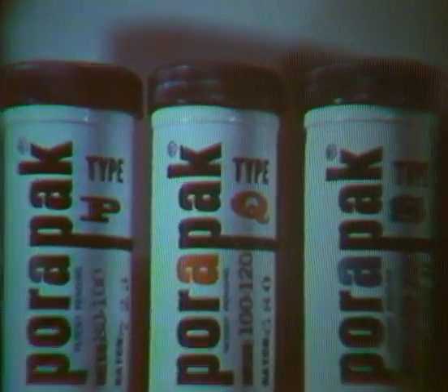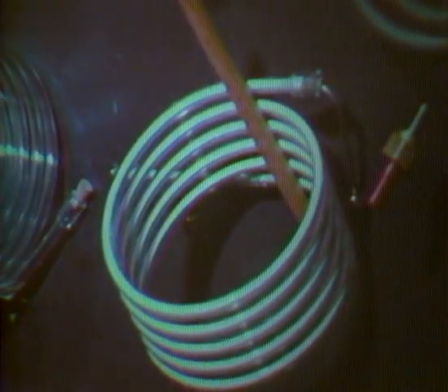Porous polymer resins represent a special type of column packings. The materials are tightly packed into the column.